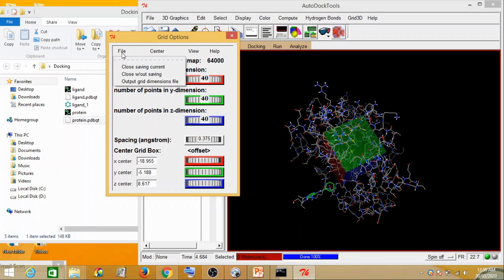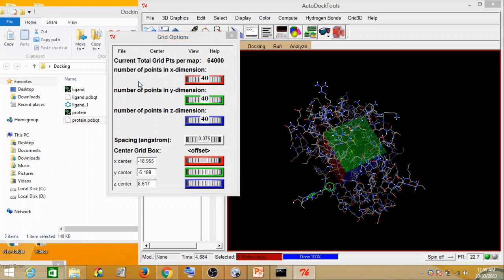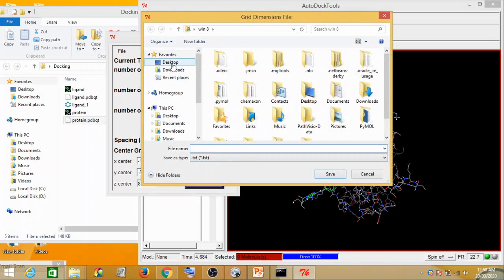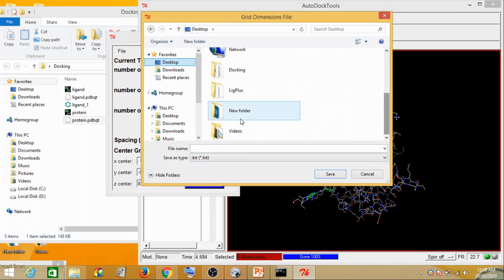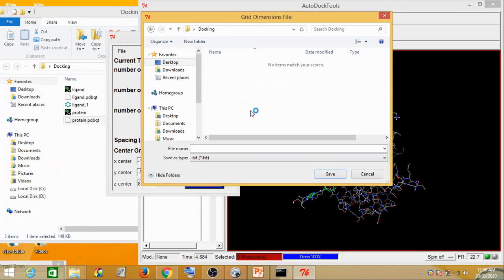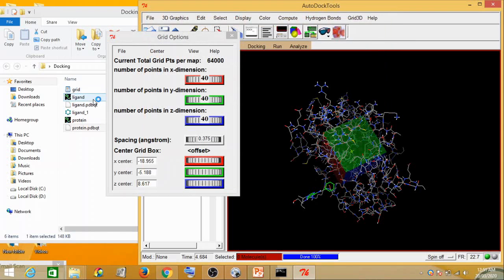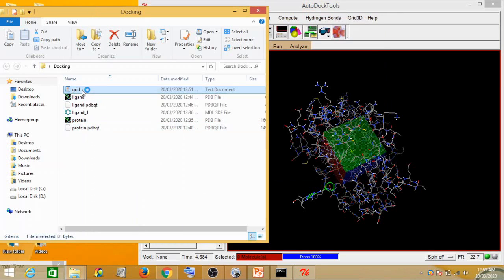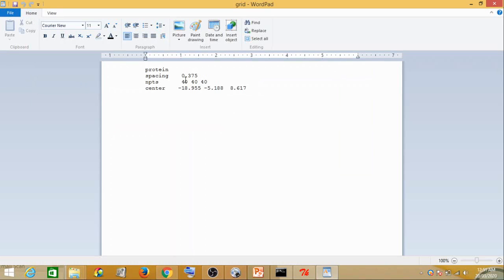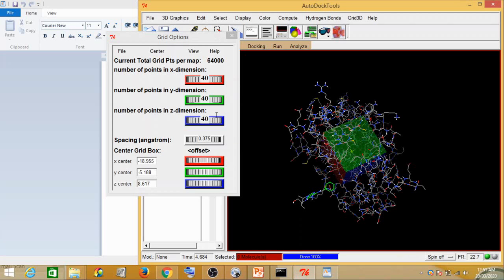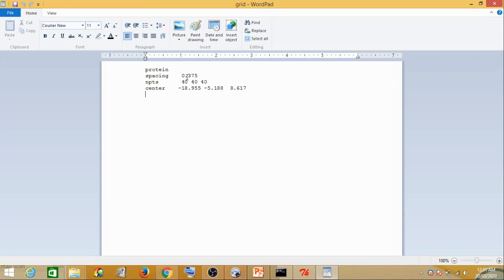What you have to do is click on File, then Output Grid Dimension File. A .txt file is generated. You go to your docking folder and save it as 'grid.txt.' The grid file has been saved. If you open the grid file, you can see these same dimensions — what you see in the grid box panel is saved in this text file. This grid file is very important in the next step.